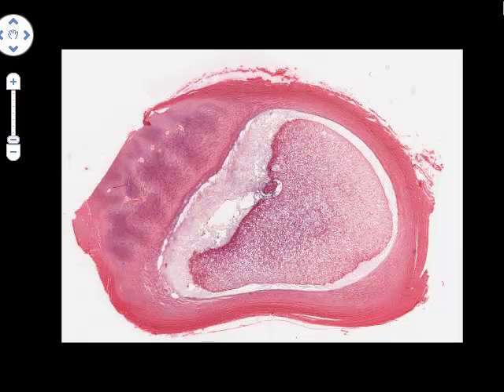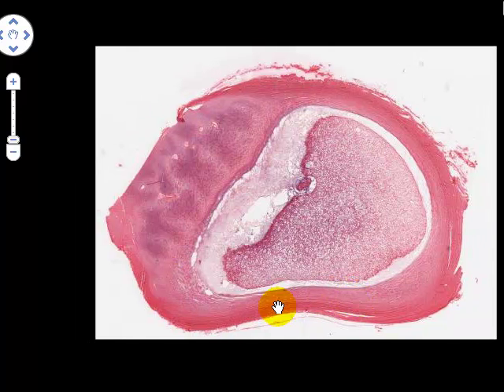So if you use the search term cartilage in the NYU virtual microscope and take the 6th slide from the list which you get, this is the slide we're going to look at here. Understanding this slide takes a little bit of knowledge of the position of the intervertebral disc and the structure of it, and I would ask you please to consult your notes for some cartoon diagrams that illustrate this a little better. But here the intervertebral disc broadly consists of an outer annulus fibrosus or fibrous ring, and this is where I'm showing with the pointer along here and along here, and this surrounds a central core region in here which is filled with a jelly-like material, and this core region is called the nucleus pulposus.